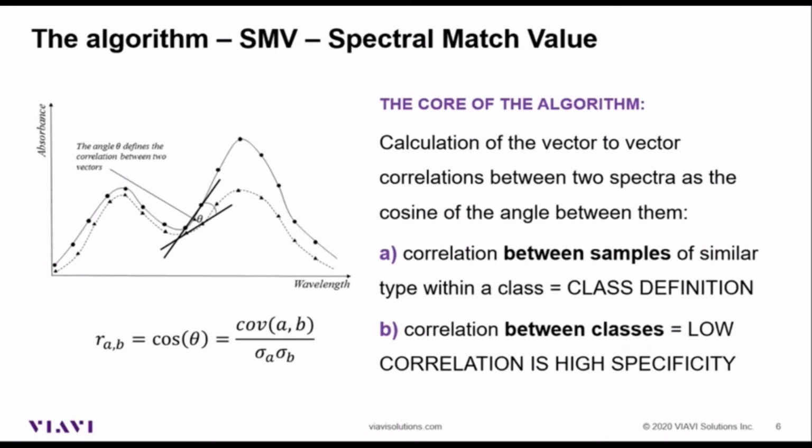It means that I have 2 spectra. Consider that one spectrum is the fingerprint of a specific ingredient. I want to see point by point, wavelength by wavelength, the correlation between the spectrum of magnesium citrate, the spectrum of paracetamol, and the spectrum of sucrose.